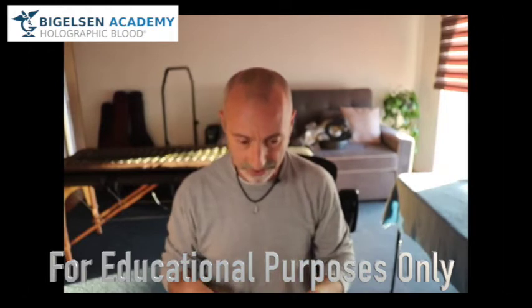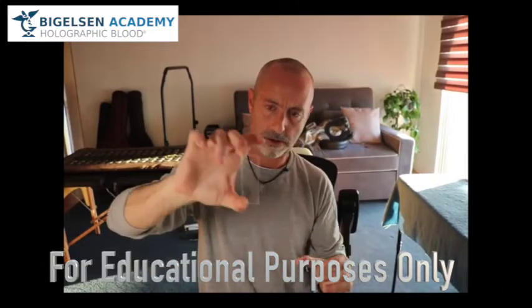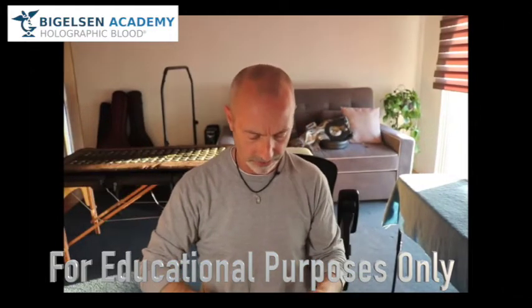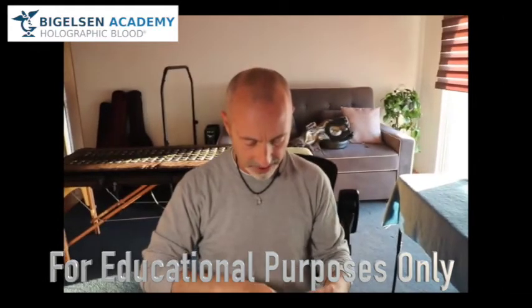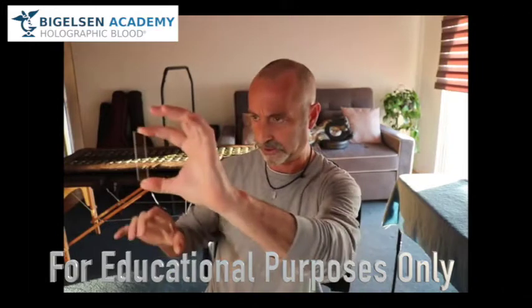Let's take a look. Here they come. These are as good as we've seen in quite some time. Knowing that microscope slides can be very dirty — as we've taught our training courses, we have taught our students to look at dirty or just blank slides so they know what dirt looks like, so they're not mislabeling things. That's just dirt.